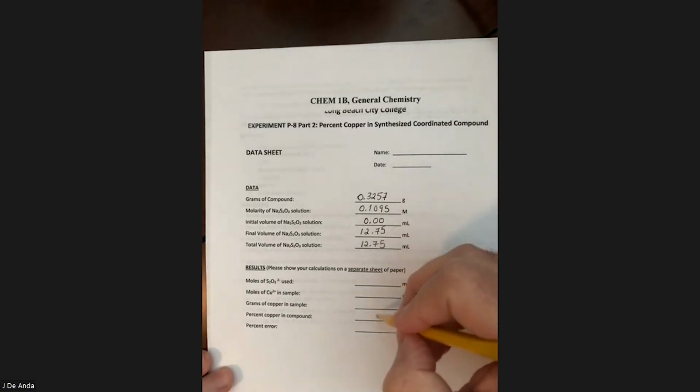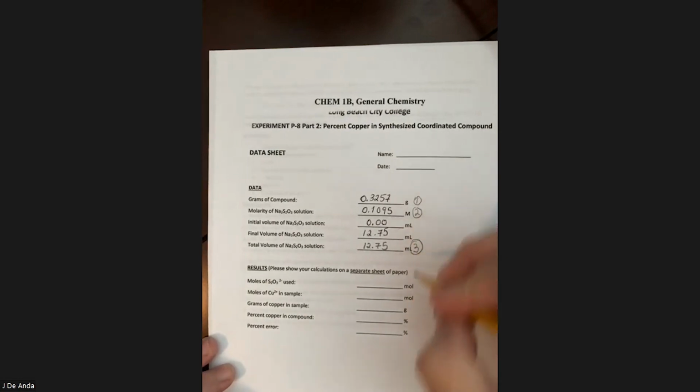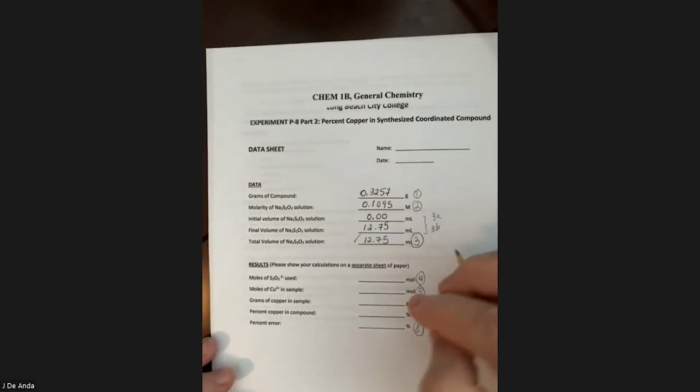So we're going to do several calculations here. I'm going to put some numbers here, sometimes it helps: 1, 2, and I'm going to put this as 3. And then we're going to number these: 4, 5, 6, 7, and 8. And notice that I skipped these 2 here. If you want, we can call these 3A and 3B, in case you didn't start at 0.00 milliliters. But the important thing is, what was the actual final volume? So let's do a few calculations here.